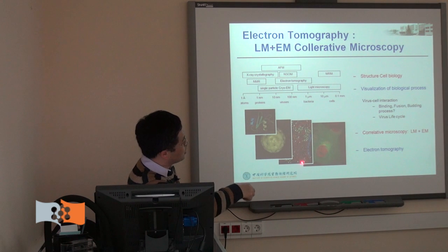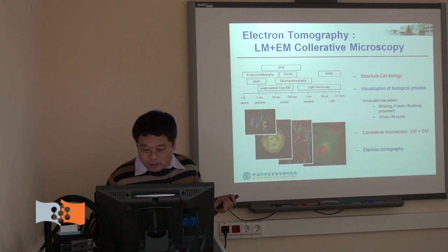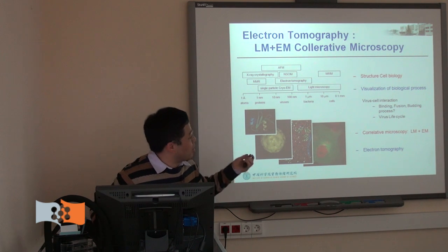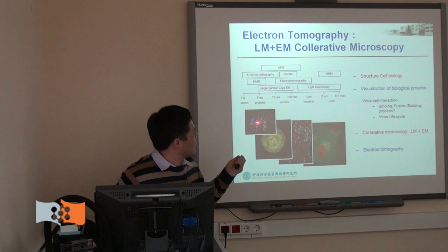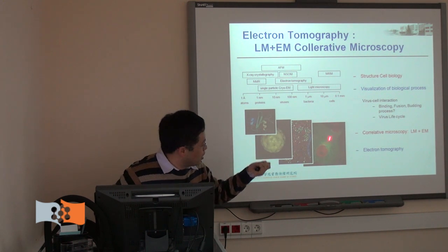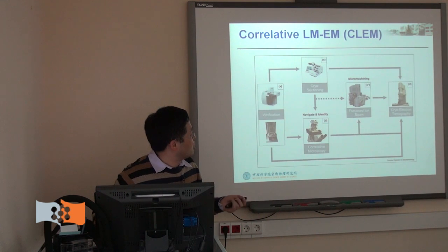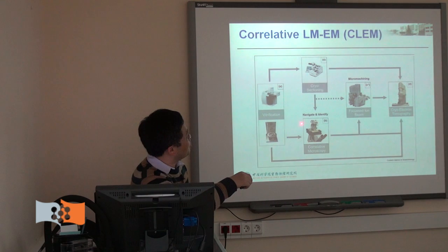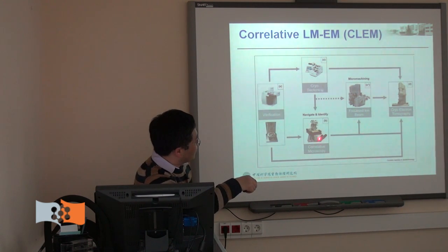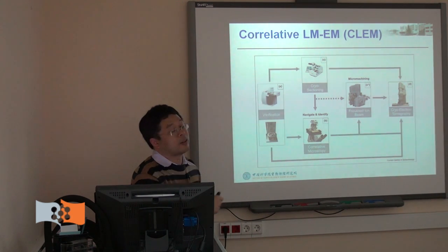So we use electron tomography to bridge the gap. That's our dream: to visualize how these proteins work in the cellular background. That's the platform I mentioned in my previous session. We use both correlative LM with TEM and also SEM.